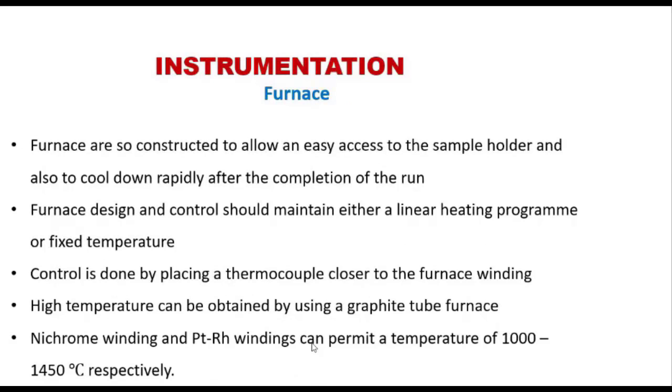And you have the furnace. The furnace is constructed to allow easy access to the sample holder, so you can keep the sample in it and easily insert it into the furnace. And it should be able to cool rapidly after carrying out the experiment. The furnace design and control should maintain either a linear heating program or a fixed temperature, whatever type of adjustment is needed.